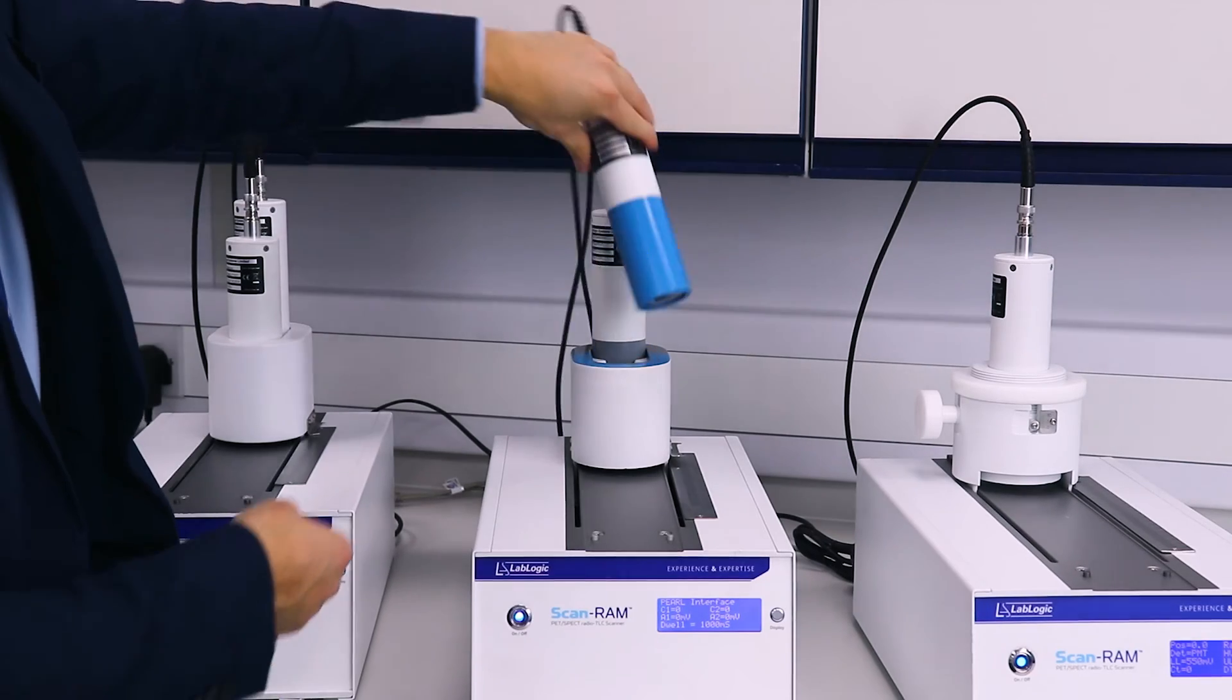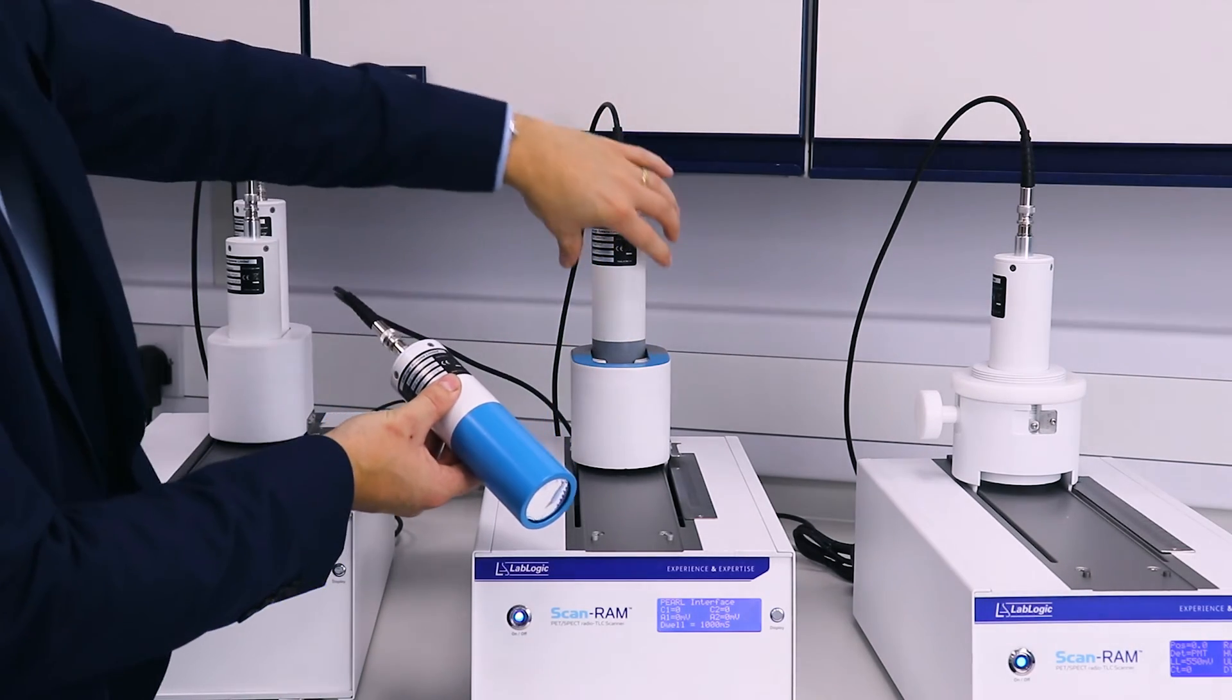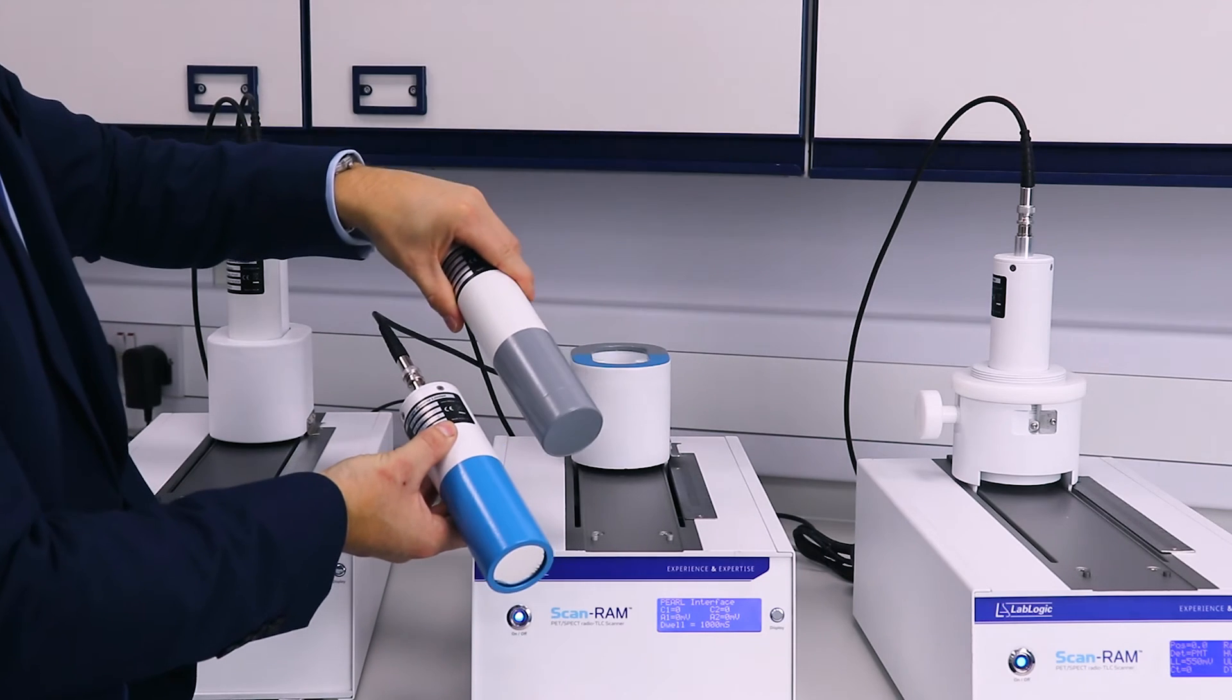The TLC DUO version of the ScanRAM has two detectors and this means no matter what the radionuclide you will always have the most suitable detector connected.